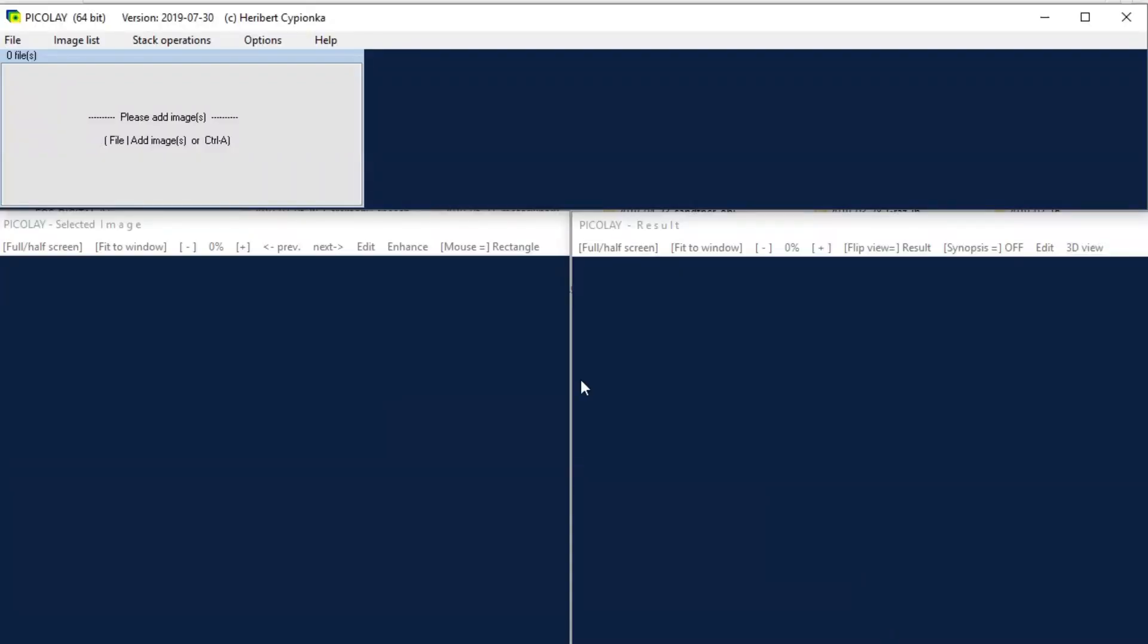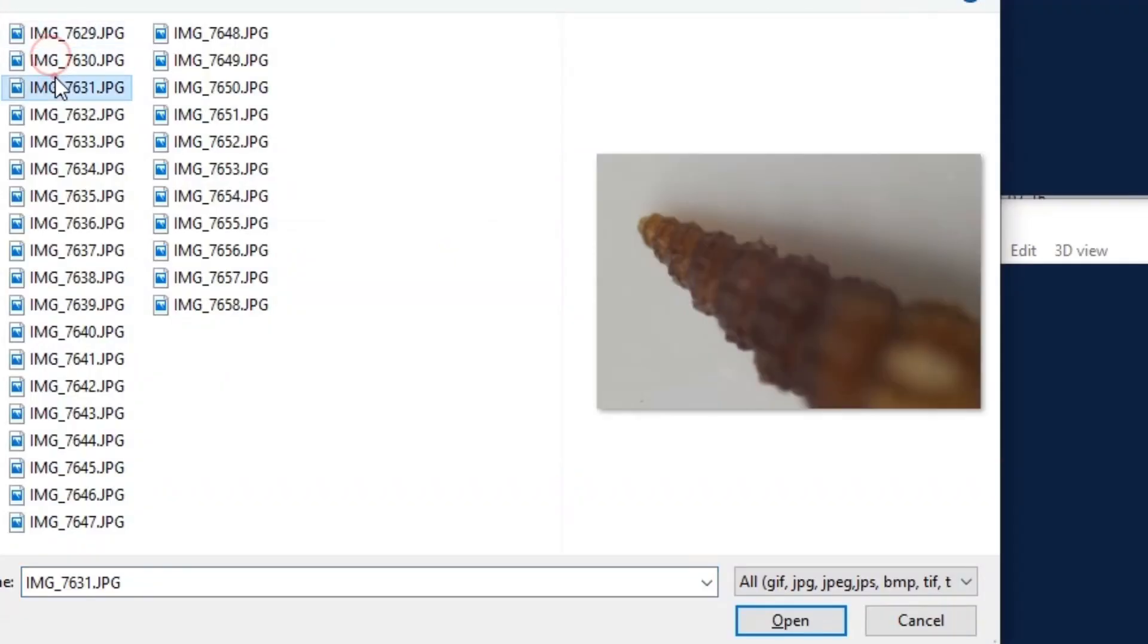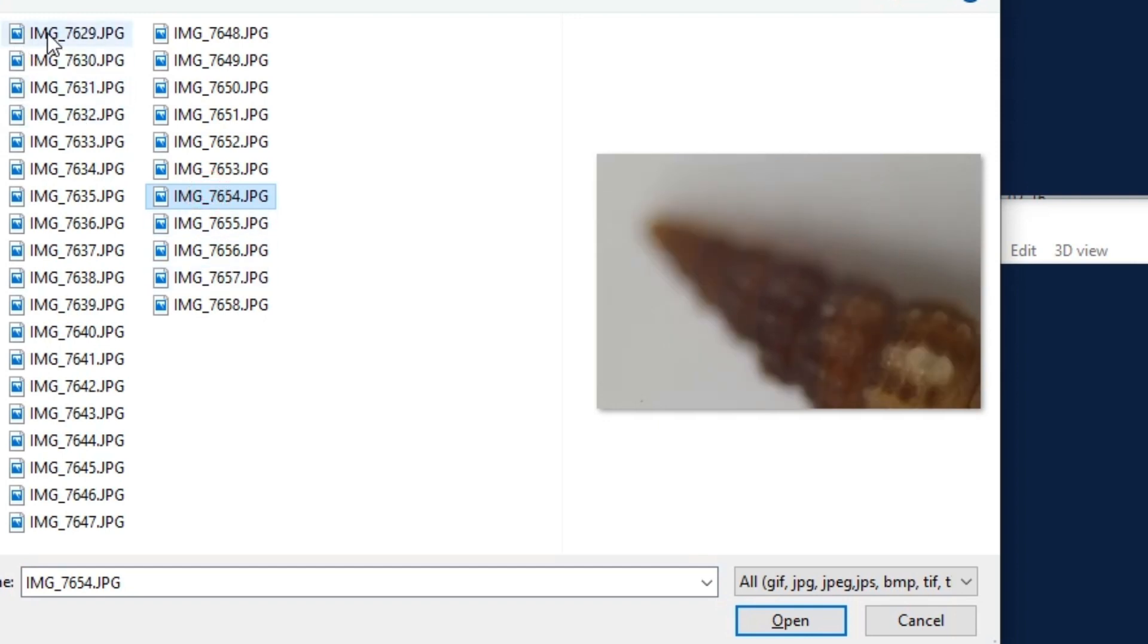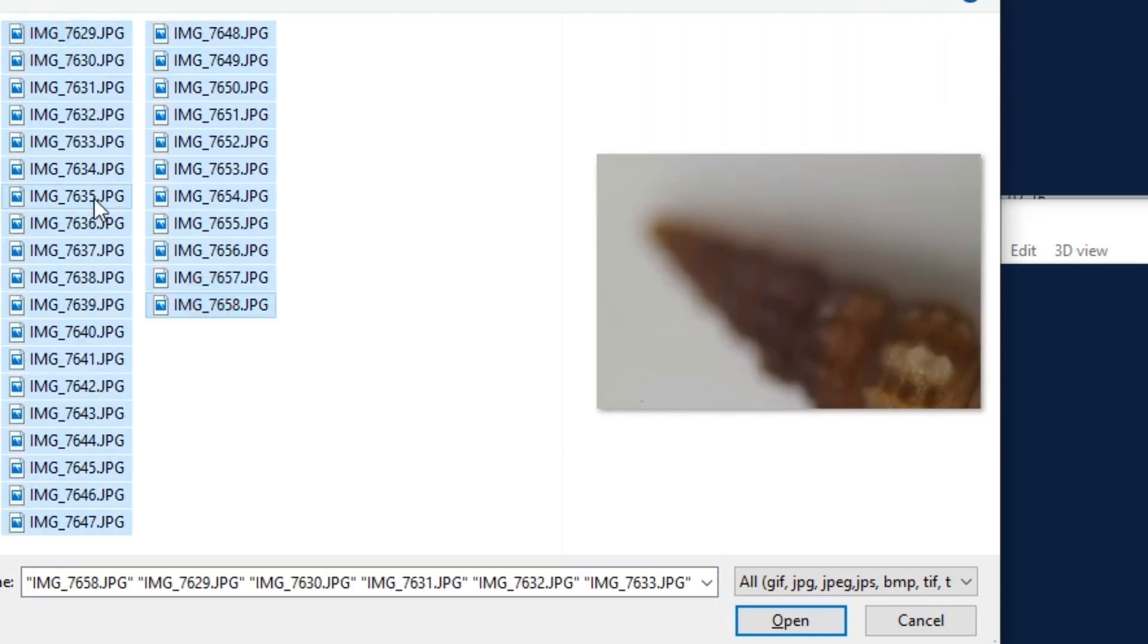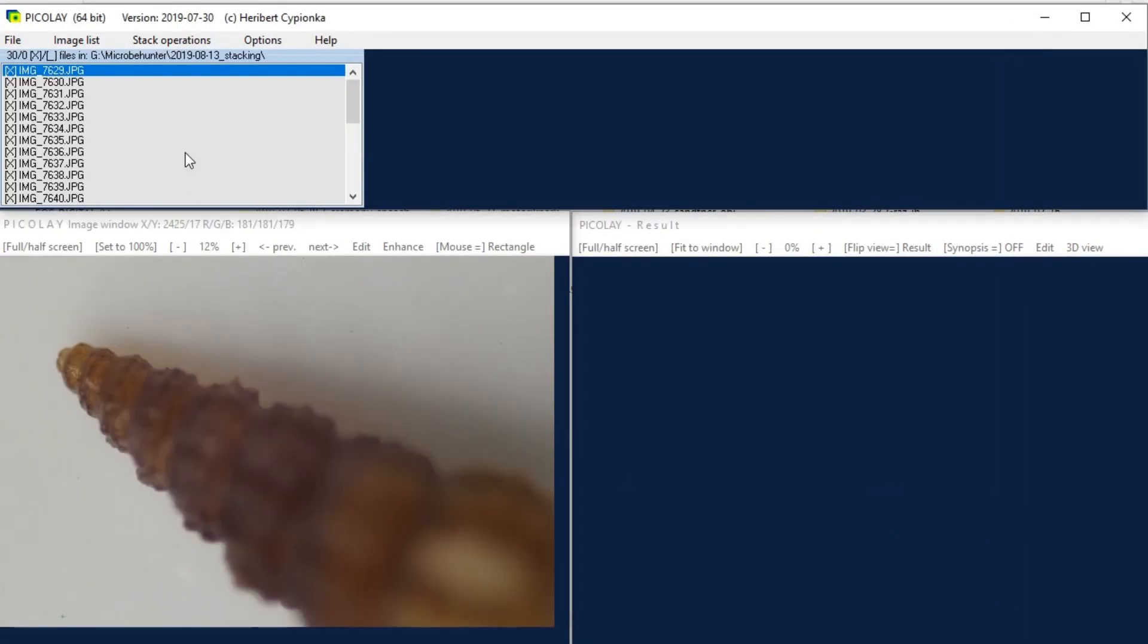So this is what you get when you start the program and on the top left this is where you can add the images you press ctrl a and you open the images that you want to stack together and then you select them first you click open and in my case the images are unfortunately reversed they are in the wrong order.